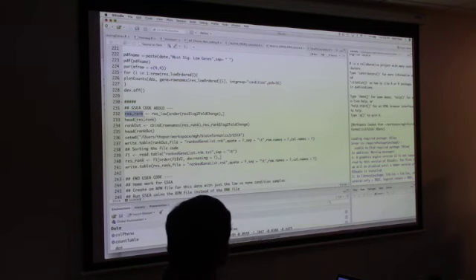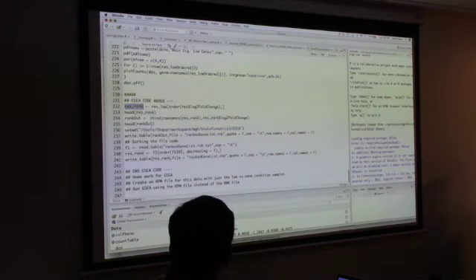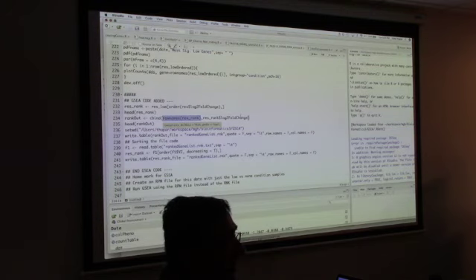Cool. Then we're going to go ahead and create another object where we basically take two things, the name of genes and their fold change, and create a new data frame like this. This is your ranked gene list. It has two columns, the names of genes in your result and their log2fold change when ordered by the rank. Clear? Yeah? Okay.